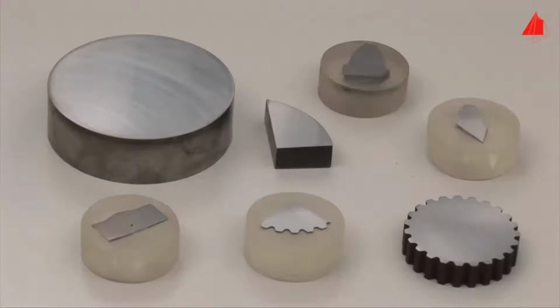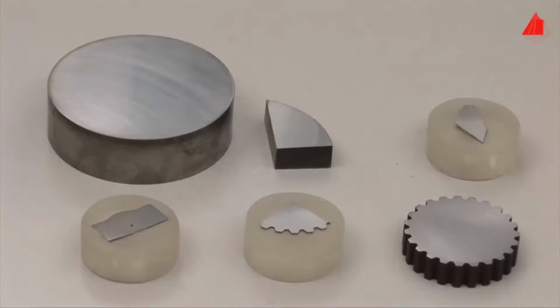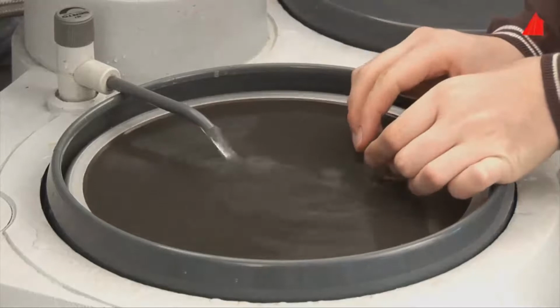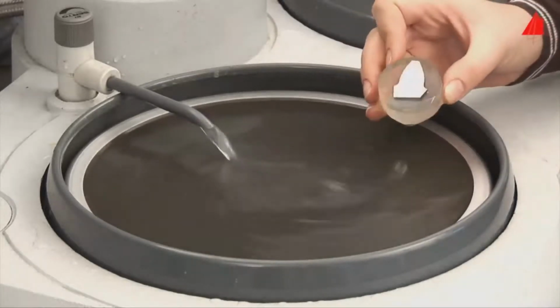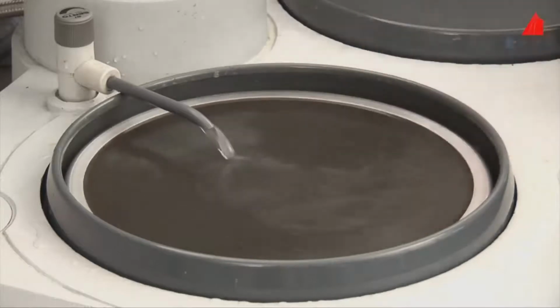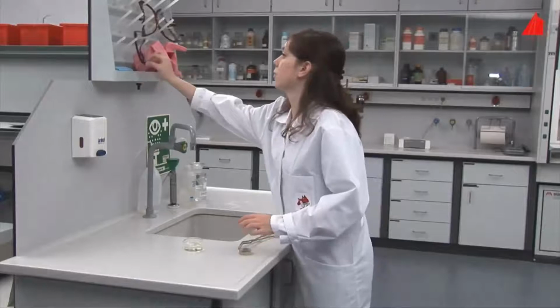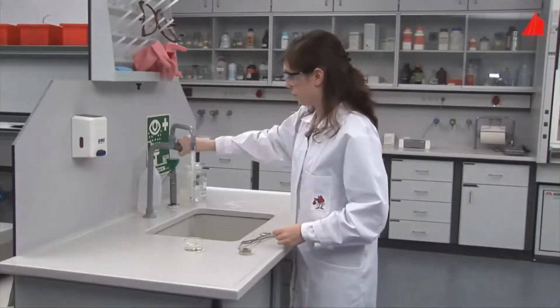This was done towards the end of the preparation, as shown here in the case of the tooth of a gear wheel. After grinding, not much is visible except from the typical grinding marks. As before, the internal structure will only be revealed by etching. But now the material tester uses a different etchant. This time it is nitric acid diluted in ethanol.